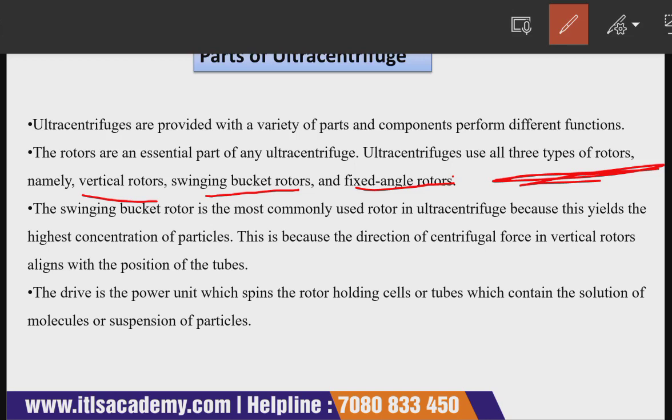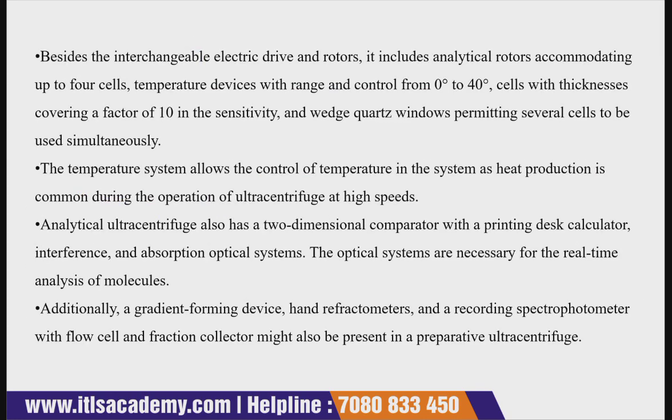Then comes the drive, which is the power unit that spins the rotor holding cells or tubes which contain a solution of molecules or suspended particles. Besides the drive, rotors include analytical rotors accommodating up to 4 cells.